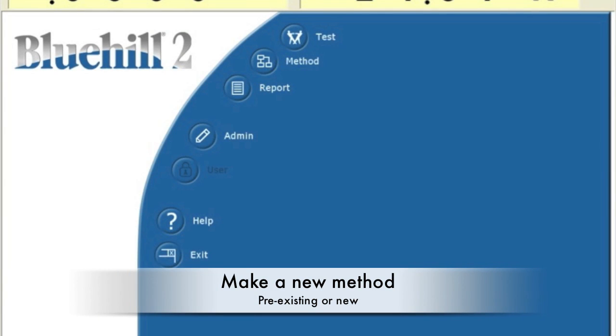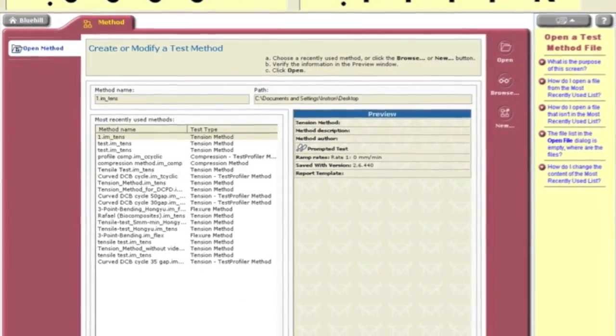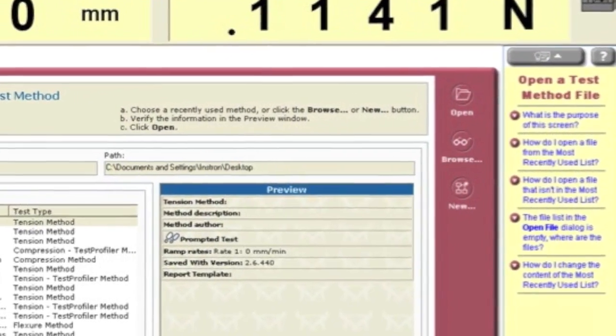To make a new method, click the method button. You can pick a pre-existing method using the browse button or create a new one. Press new and pick the type of test, which is tensile in this case.